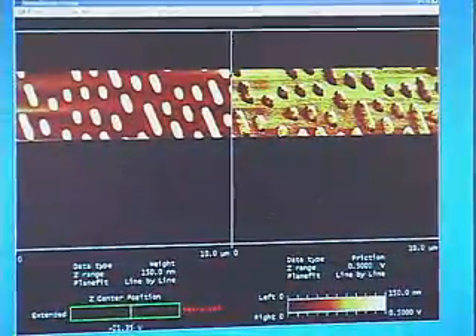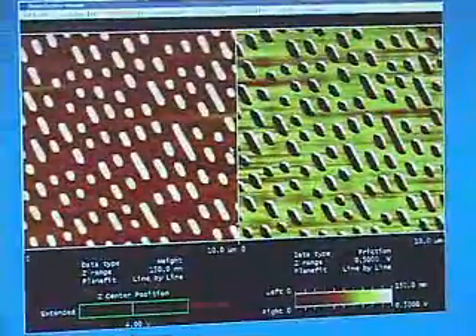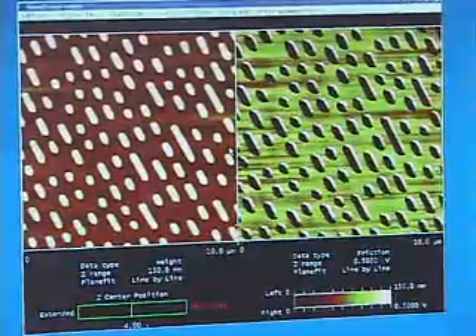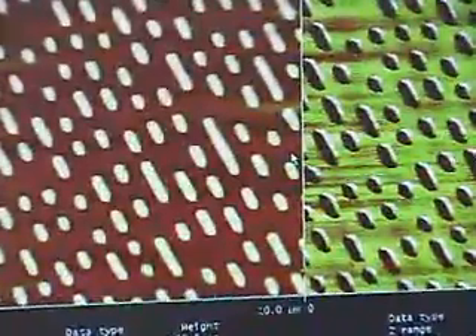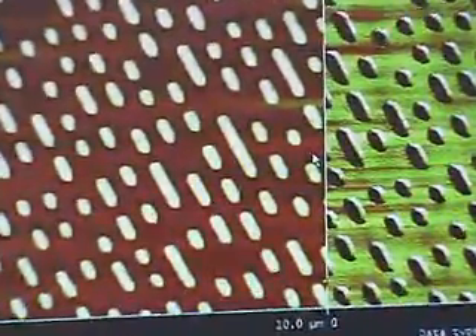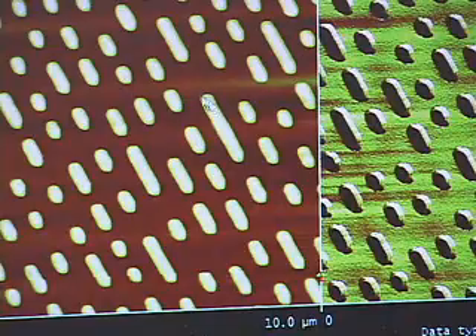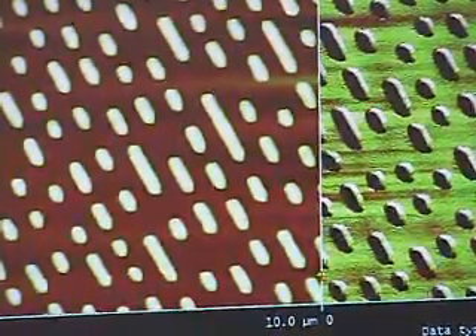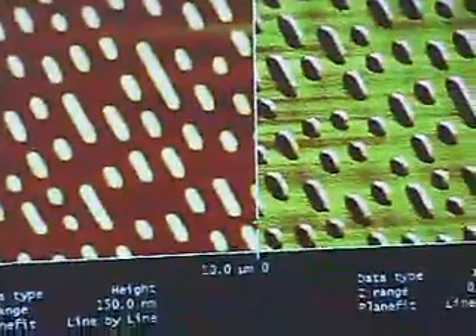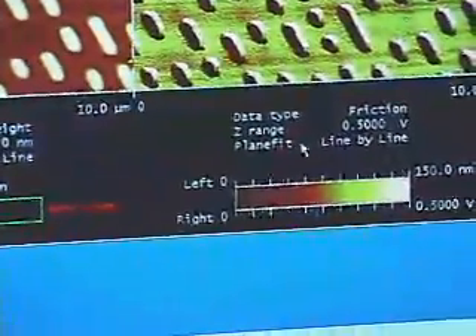The computer then converts this force information into the height of the surface at each location on the sample. Now that the scanning process is completed, we have a 10 micron by 10 micron image of our DVD surface. This is a topographic image — the bright features are raised above the dark brownish-orange features, and by the scale at the bottom, the bright features are about 150 nanometers above the lower surface.